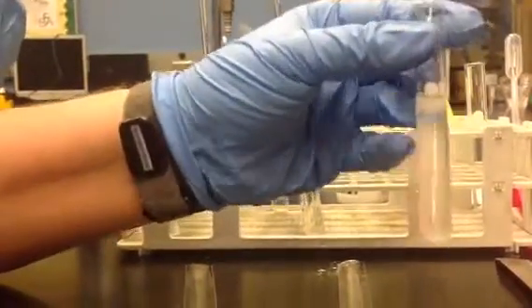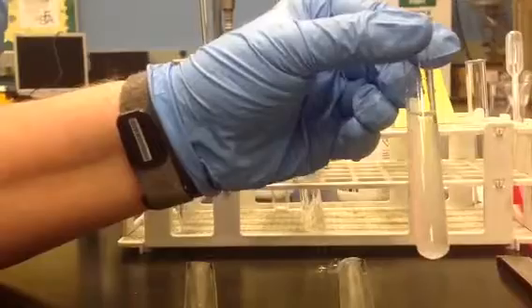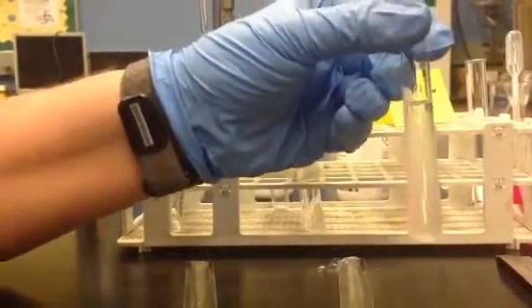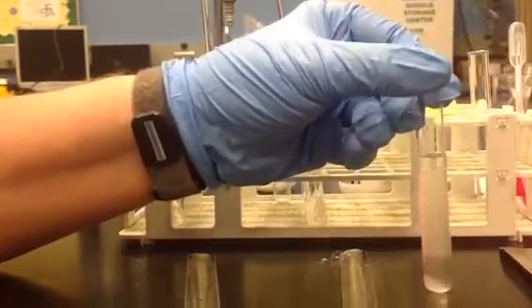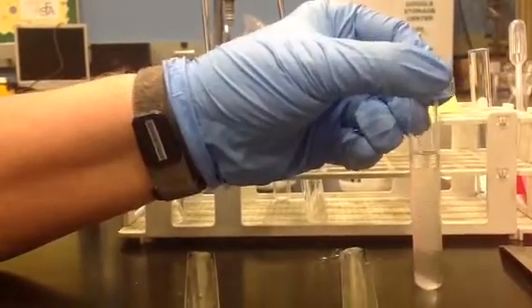Just for the video, I'm going to invert a couple of times to really show you that I am letting it mix with both the water and the ethyl acetate. And I can do this because I have gloves. And you can see the silica gel is suspended in that, but it's still not dissolving.